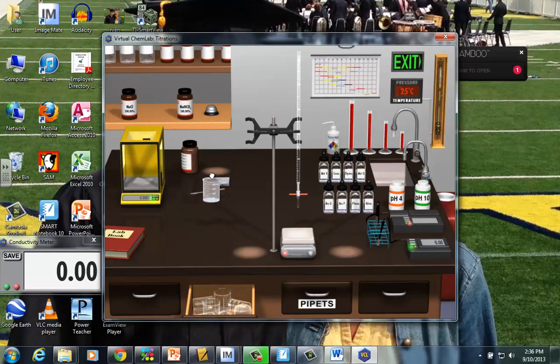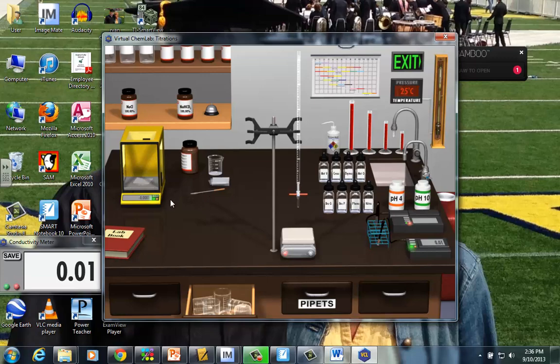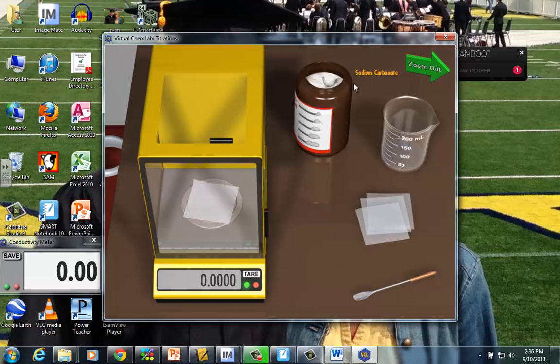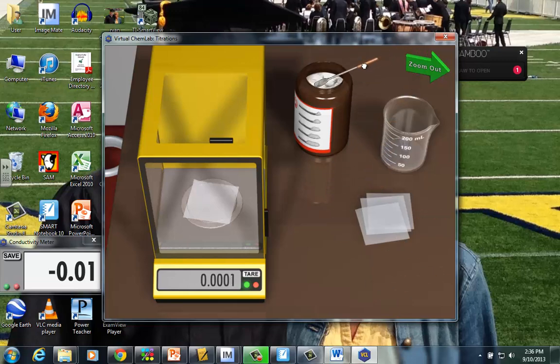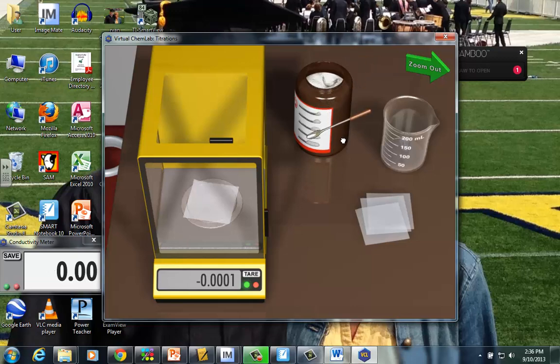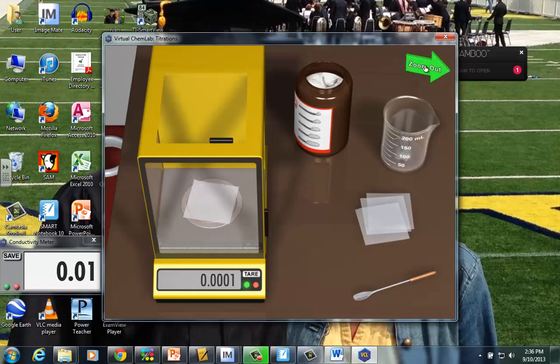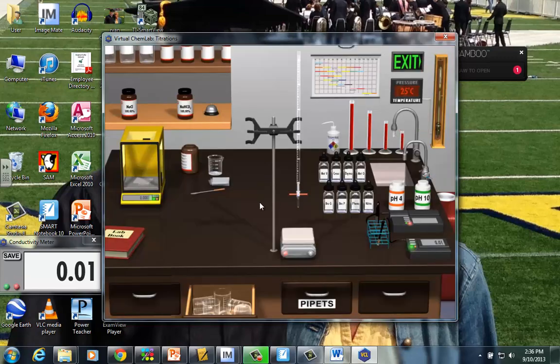Put up a fresh beaker. And just grab it here so we can make that into a solution. Zoom into the balance so you can drag that on. Click the lid to take it off. This is the part that takes technique. Taking that spatula and just drag it across the label to pick up the compound. And just plunk it on the scale. And it'll be about a gram. Then pour that into the beaker and zoom out.